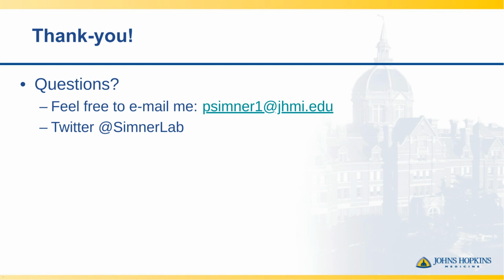That's one thing we're planning to work on as our next study. And to tie together some of the other questions, we're going to work on using the Flongle, trying to do this more in real time along with clinical care, to assess how well we're doing in terms of workflow in the lab, as well as cost comparison from an FTE standpoint and a reagent standpoint. Great. So that's where we're going with that.